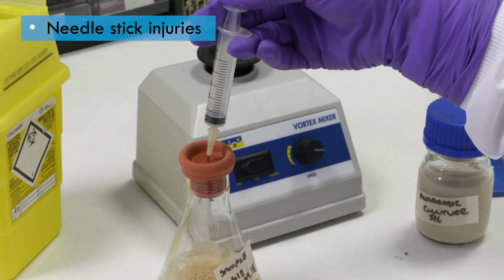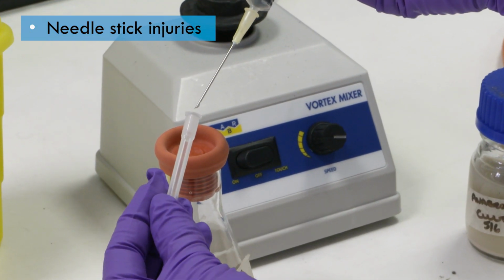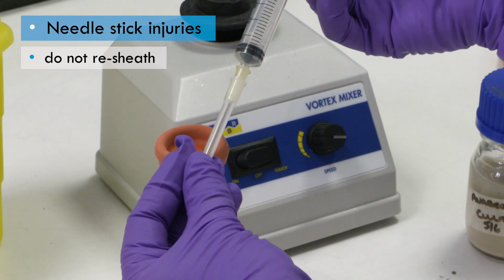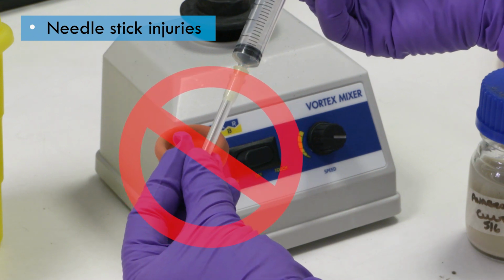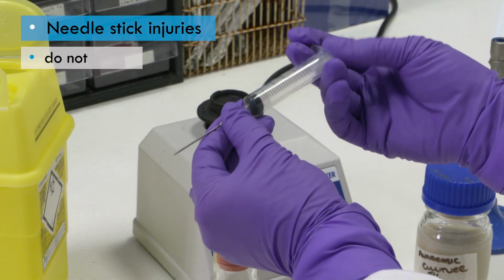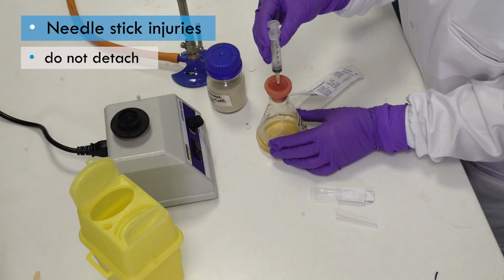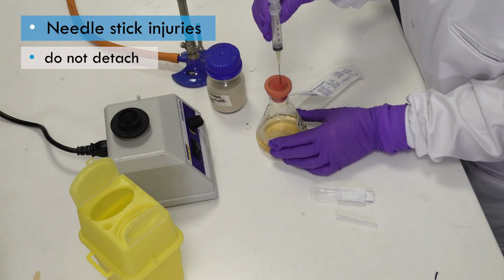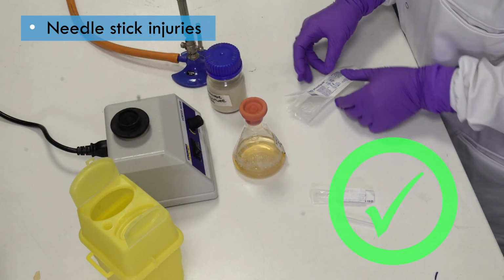Laboratory-associated infections are commonly caused by needle stick injuries. It's important not to resheath needles after use. Instead, they should simply be placed directly into the sharps bin. If needles are attached to a syringe, do not detach the needle from the syringe. Simply place the entire unit in the sharps bin. This should help to reduce the likelihood of needle stick injury.